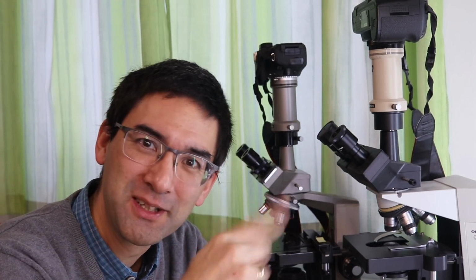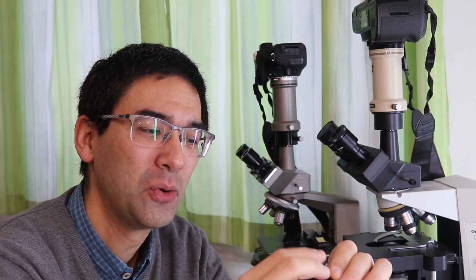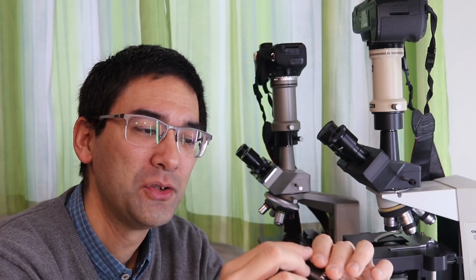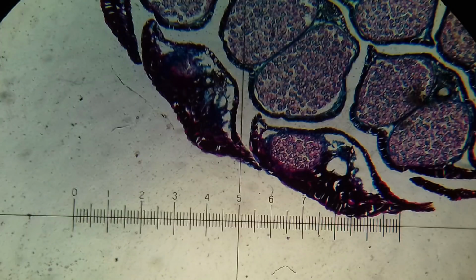And that is another thing, before I keep on remembering things. Sometimes you can also include in the eyepiece itself either a grid, a micrometer, or an arrow. If you do that, then this image of the arrow or the grid will be superimposed over the image that you see.